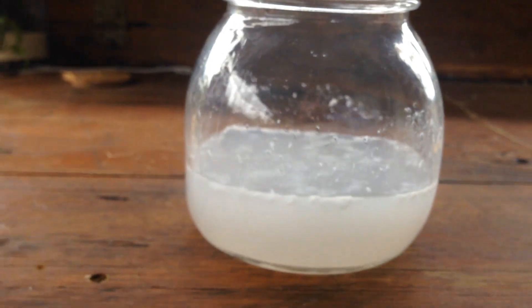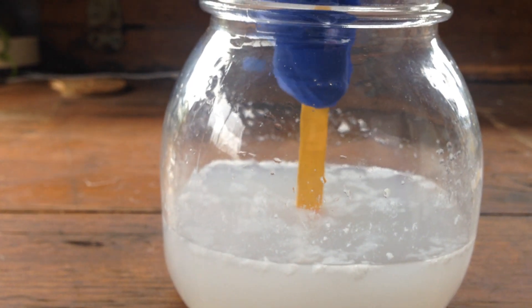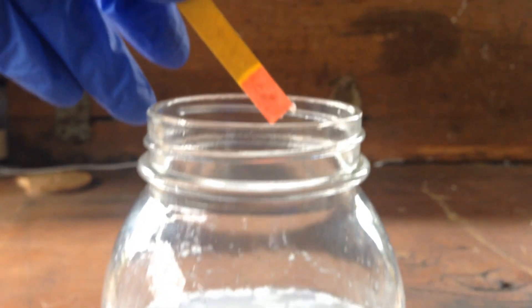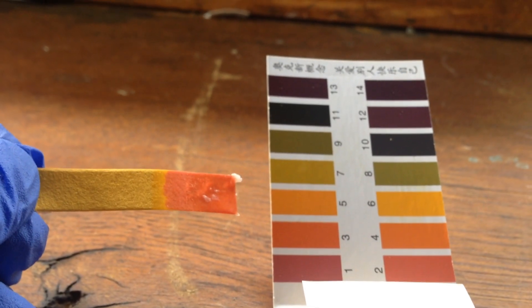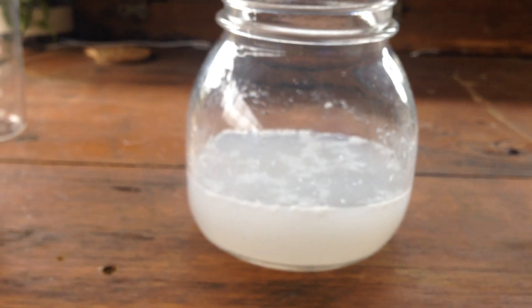To check that the reaction is fully done, we can just dip our pH paper in, and we can see that it's still a little bit acidic. If we compare this on the chart, we've got a pH of around 3. So what we can do is add just a little bit more ammonia to the solution to bring the pH right back down to 7, where we want it.